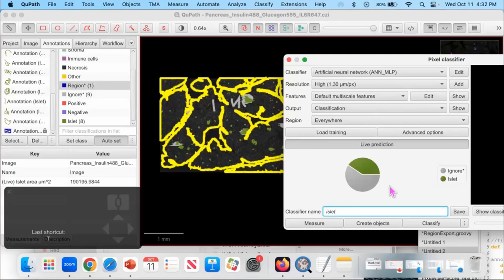You can create your own with a star. Sometimes, especially for fluorescence images, I'll make two ignored regions. One is like the black background, and one is like the super bright crap. Just having them as separate can help.